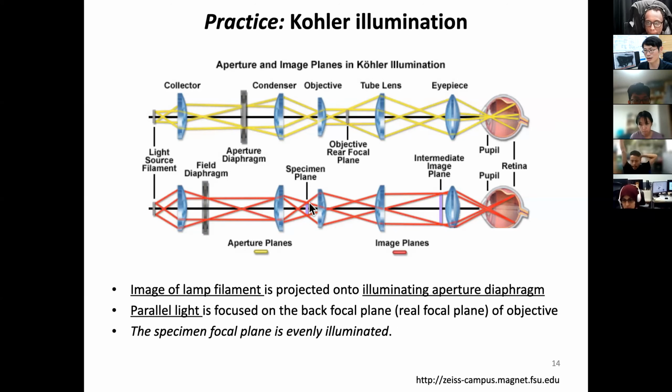However, the image coming from the specimen plane goes to the objective lens and tube lens, and it forms an image. And with the eyepiece lens, with your eye lens, you will focus down to find your image. So the sample plane is over here, and this is called the image plane, that image is here and the image is there.